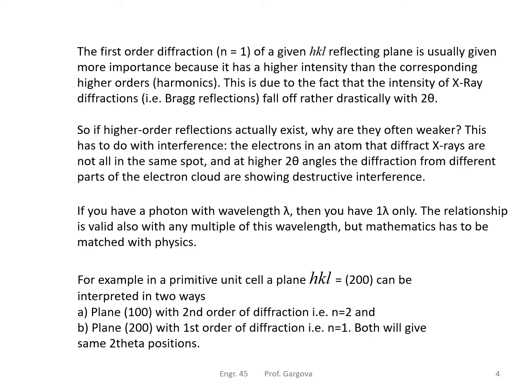So in general, the X-rays are being scattered, but think of it as being reflected. Even though the X-rays are being scattered in many directions, that won't necessarily give you the reflection you need for it to be detected by the detector and for you to get a peak there. That depends on many factors, obviously on how the atoms are arranged, but also in part on the electron cloud and how it shows the destructive interference.